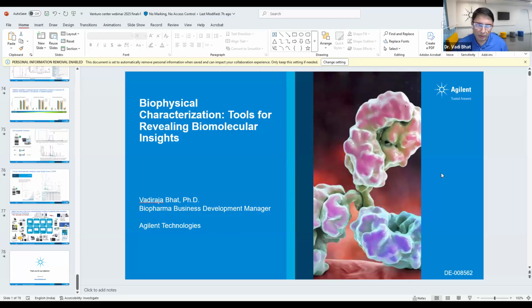And in fact, nowadays it's getting more and more popular. At least people have started discussing how it can be implemented. The reason is very simple: real-time PAT is going to significantly reduce your burden of collecting the fractions, storing them, sending them to the quality control labs, getting the analysis done, bringing that back and making a decision on what to do.